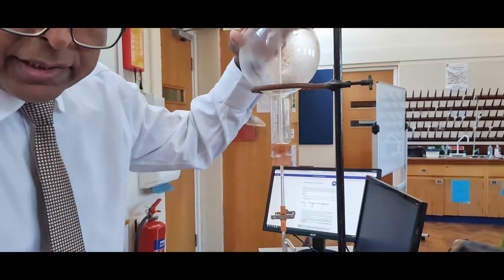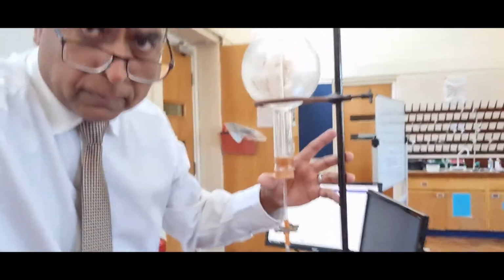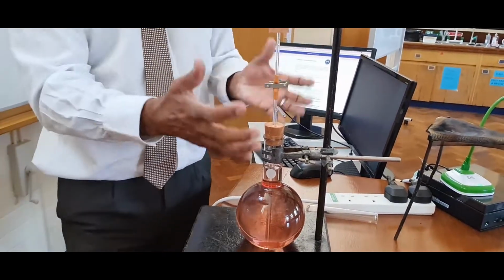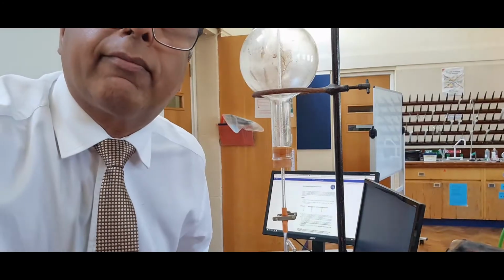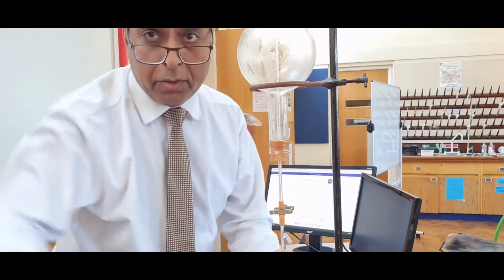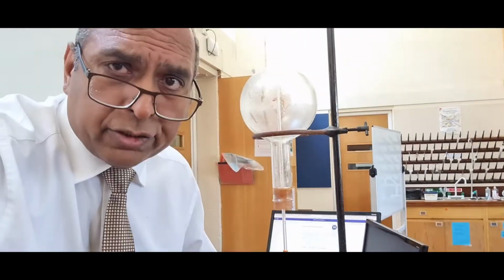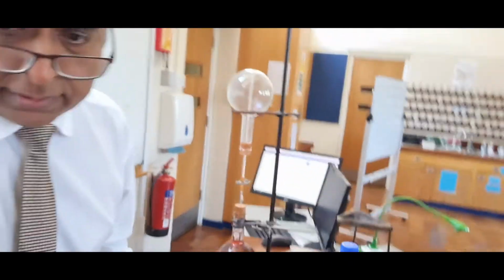That top flask will have a suction effect, and the water from the bottom flask will get sucked. Sorry, I think my hand turned off the recording there, but I was trying to say the bottom flask water will get sucked into the top flask as the ammonia dissolves into it.